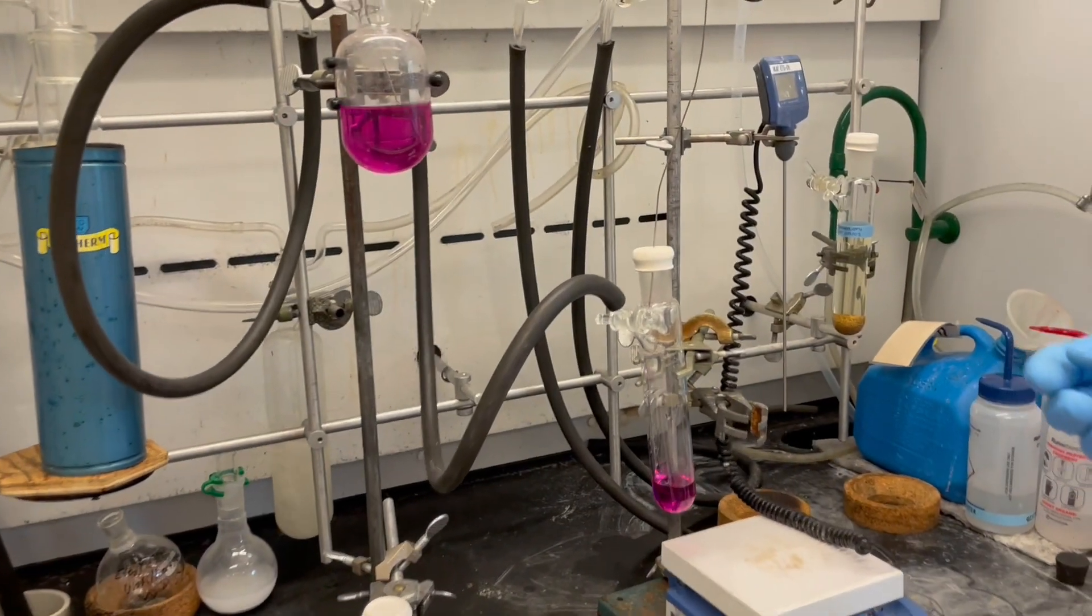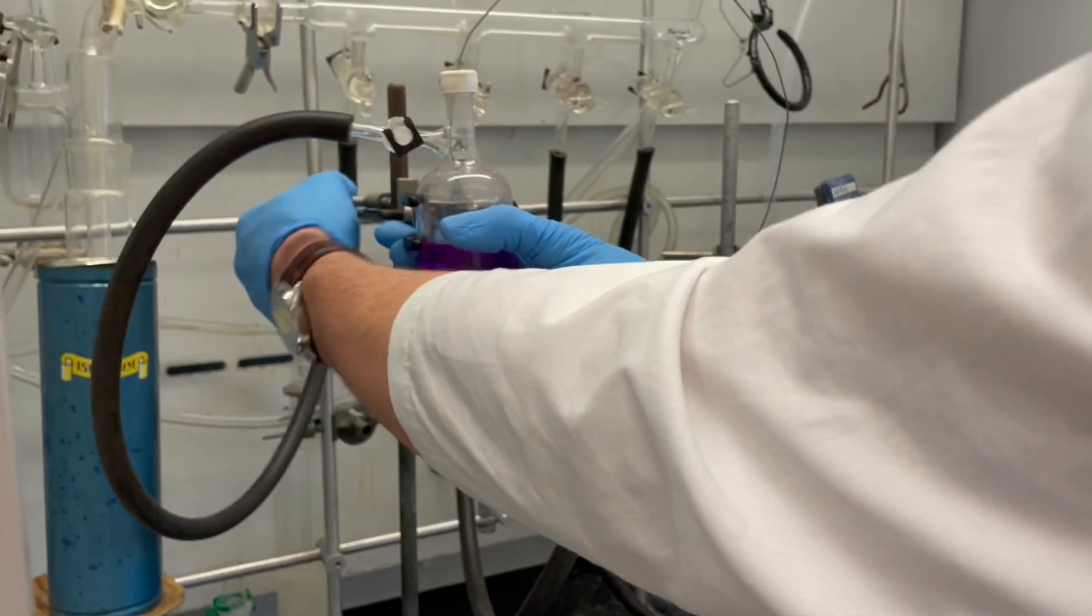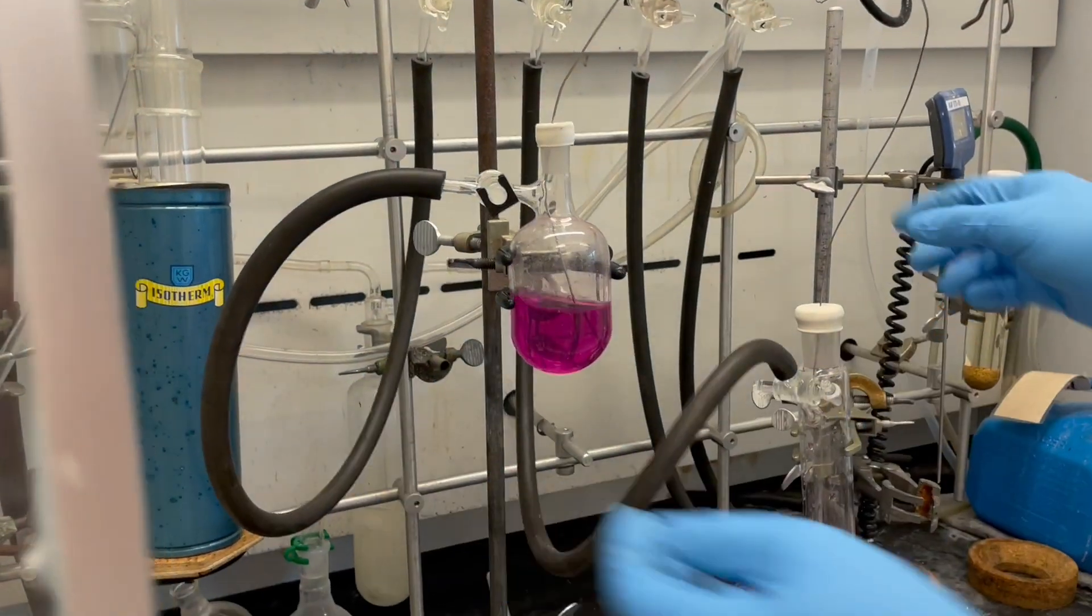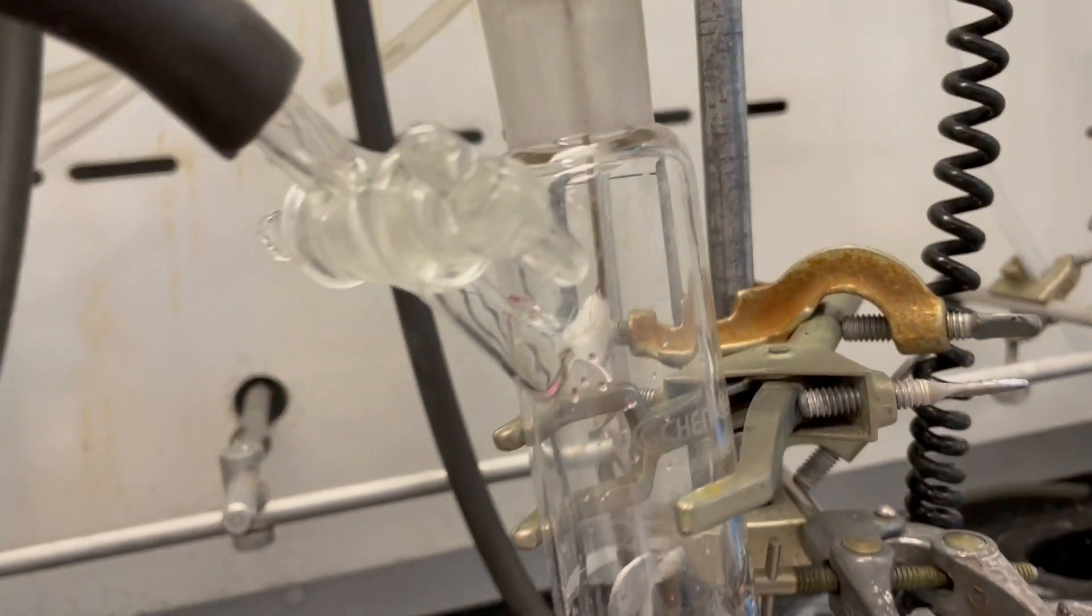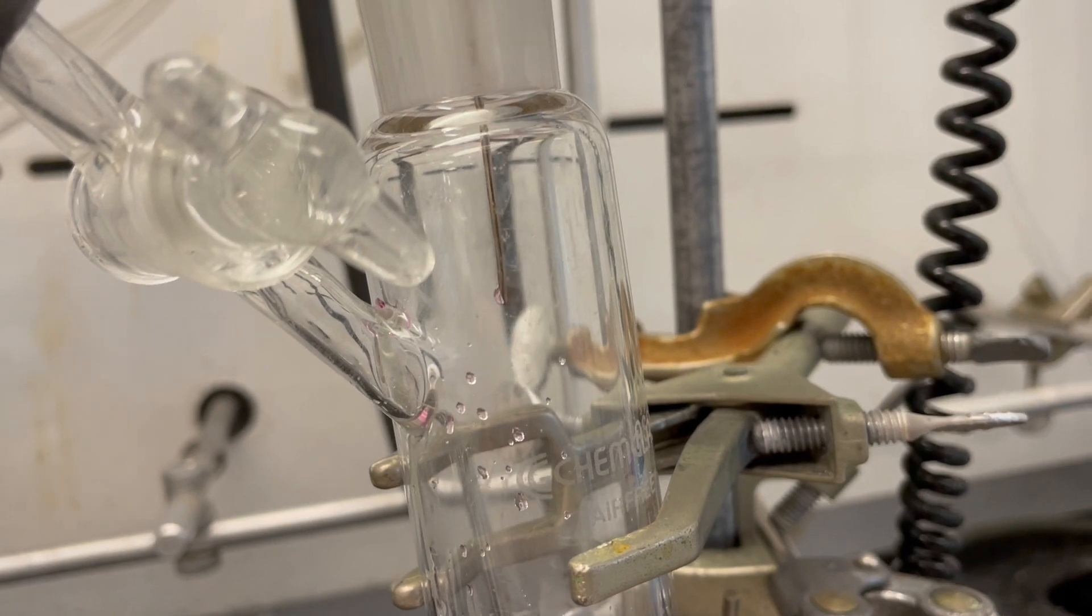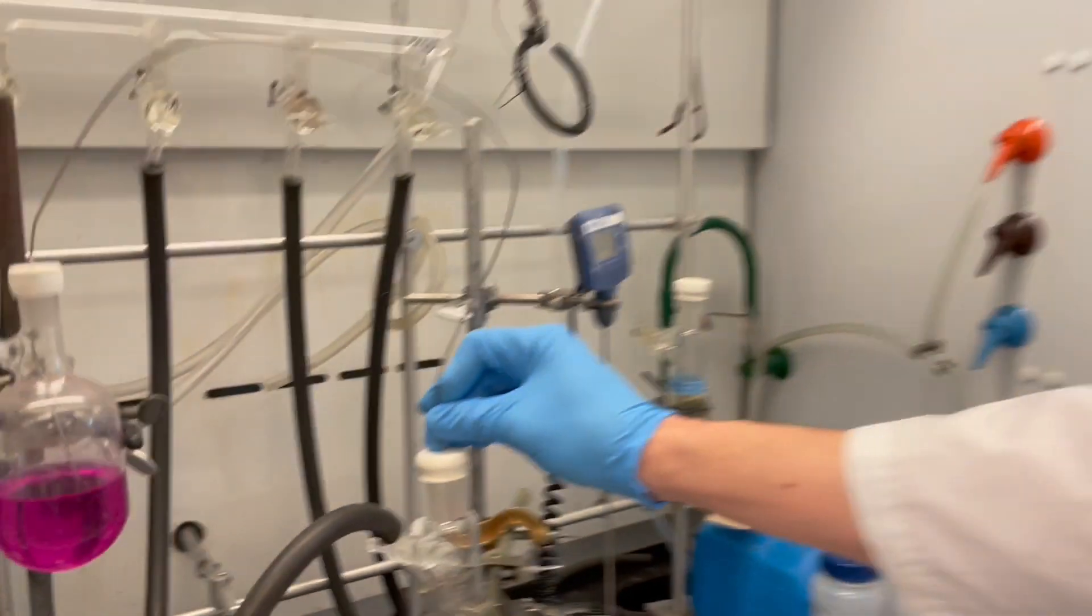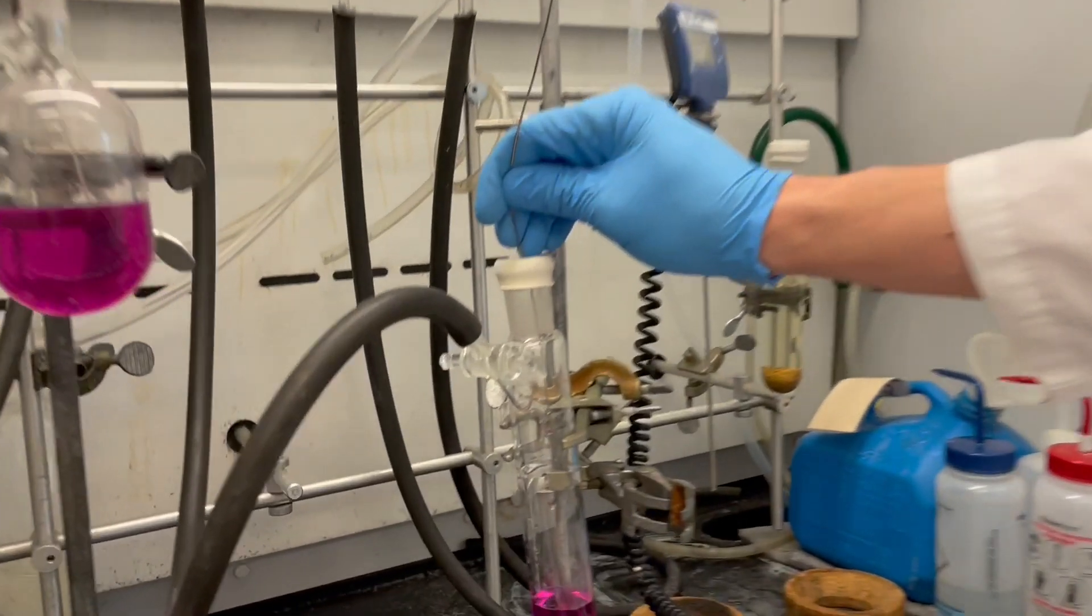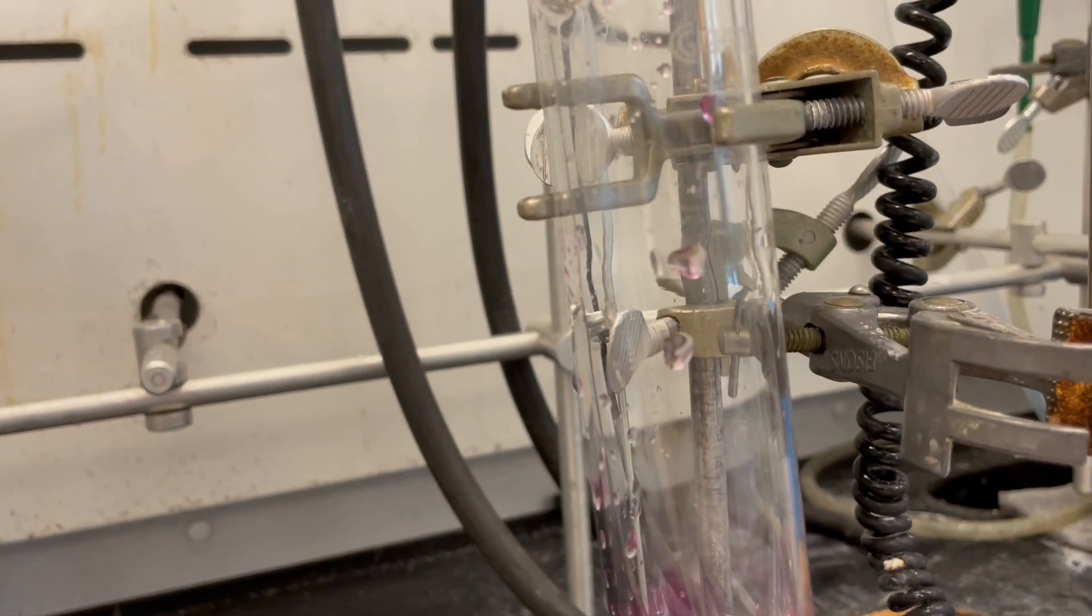The first method of control is by lowering our transfer flask. The second method we can use to increase the rate of flow is to lower the cannula into the receiving flask.